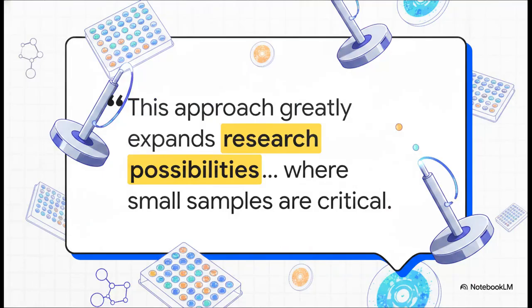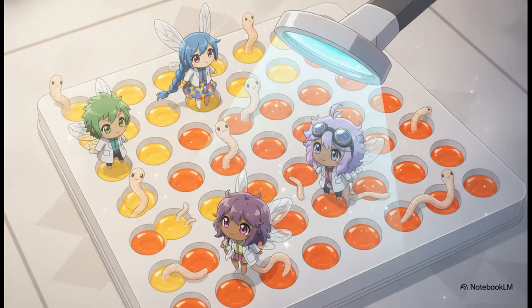Well, as Dr. Chem points out, because these new colorimetric methods don't suffer from biological interference, we can scale things way, way down. We don't need giant test tubes anymore. We can use microvolumes. Researchers are now running these assays using nanodrops or 96-well microplates, analyzing just a tiny fraction of a milliliter of sample. This high-throughput capability is a massive deal.